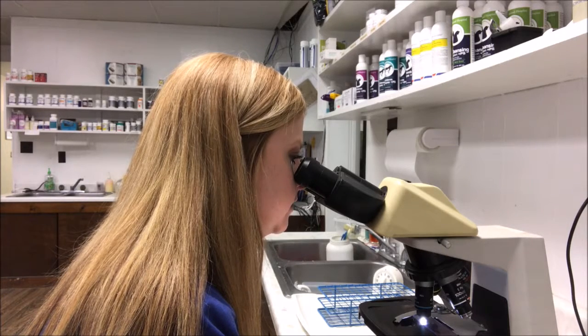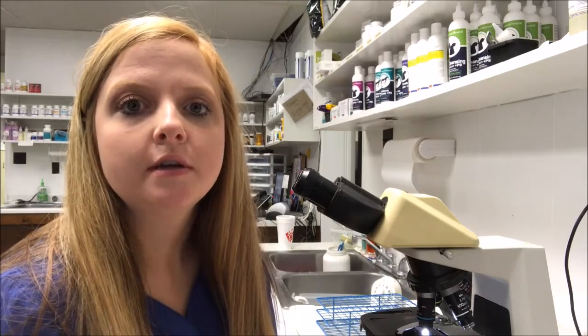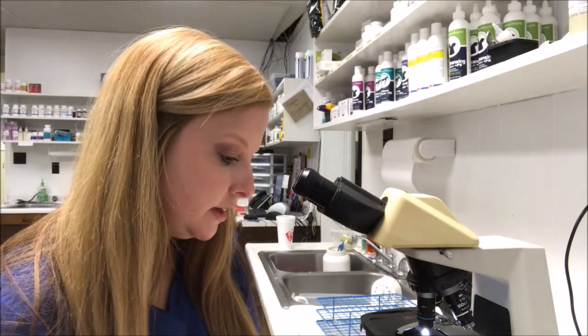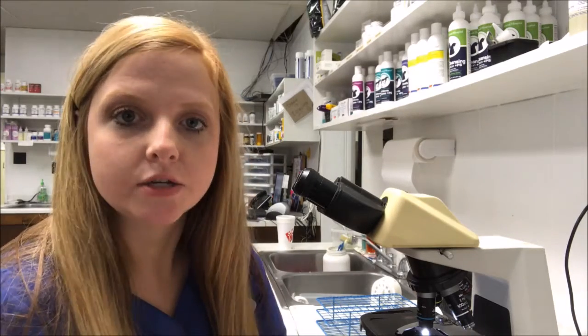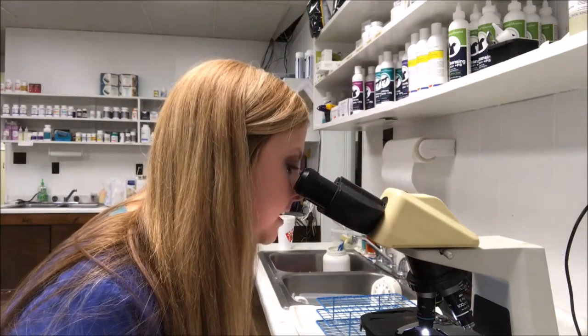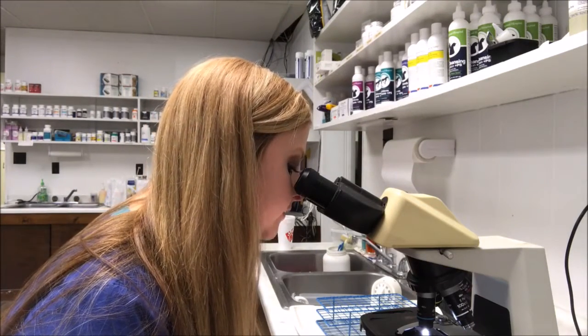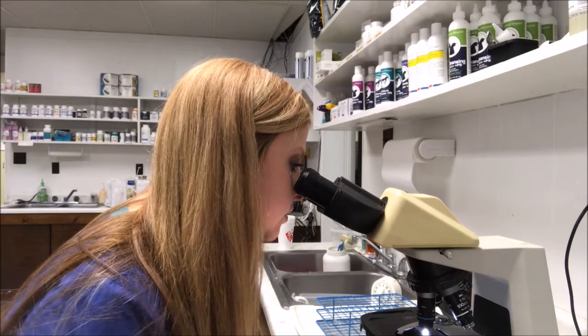Okay, here we go. So the cells are round. They're not cornified at all. So the stage of estrus I'm seeing right now is called diestrus. They're nucleated round cells. This is the stage that follows estrus. The female is no longer receptive to the male at this point, and the estrogen levels are low. These are called parabasal cells.